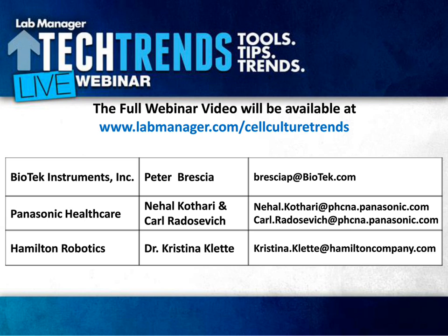Great, thank you. Any additions to that, Peter or Kristina? Yeah, I would just like to mention, on an automated system that includes an incubator, as Carl had mentioned, looking at what kind of decontamination options the incubator has, but also, on a liquid handler, make sure you look at what type of pipetting and how lab water is being manipulated around the instrument, how lids are being handled. Make sure that plates aren't being read in readers without the lids on them, stuff like that. Changing filters and good laboratory practices.